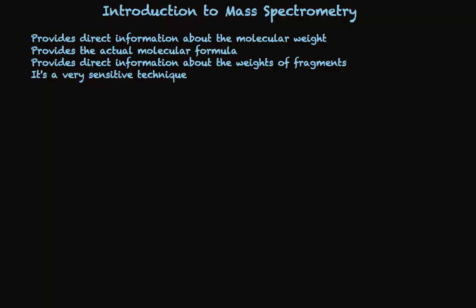Unimaginably dilute solutions can be examined for their compositions using mass spectrometry. It does not depend on the use of light, which sets it apart from the other instrumental techniques that we'll talk about.